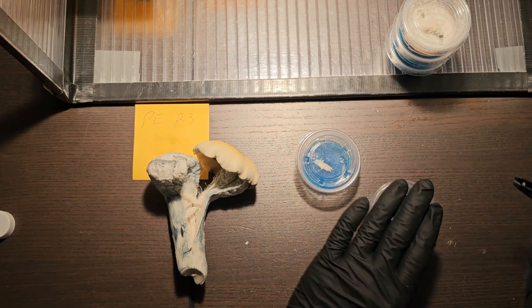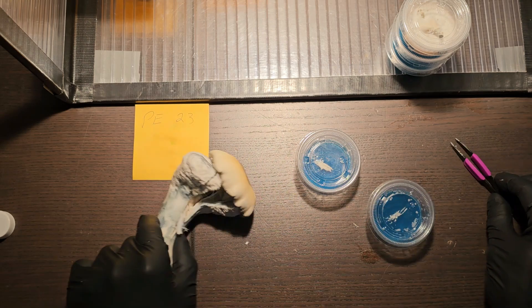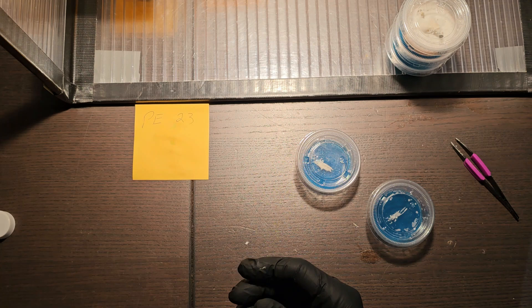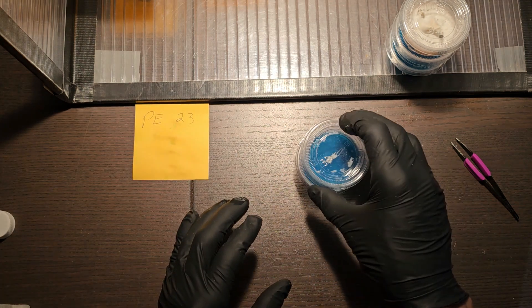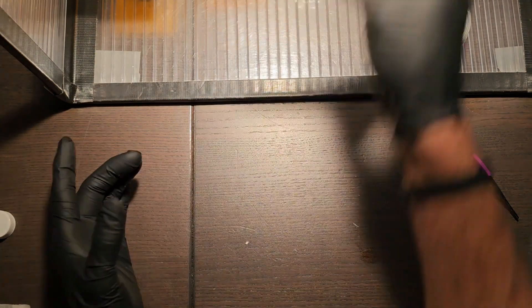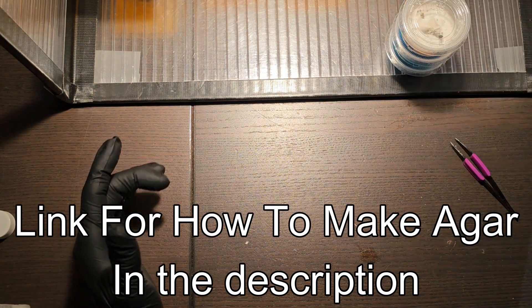When it comes to cloning, you can grab any mushroom you want — from a grocery store or from anywhere, really — take a piece of tissue out of it, put it into some agar, and you're well on your way.